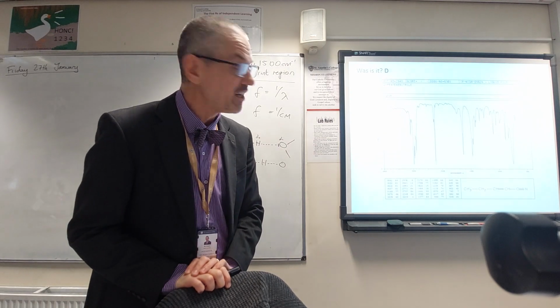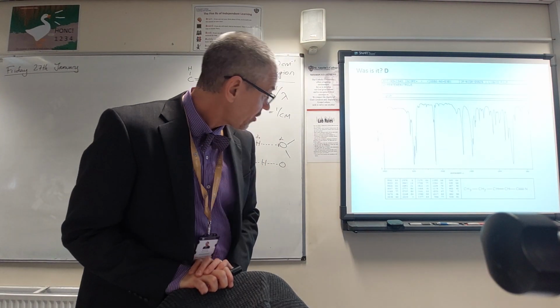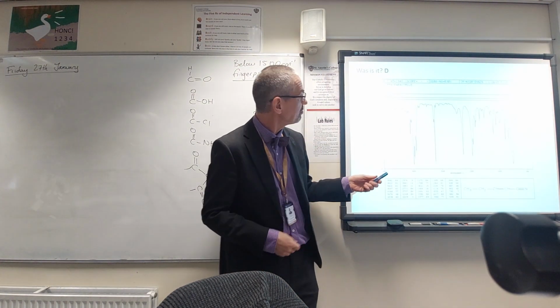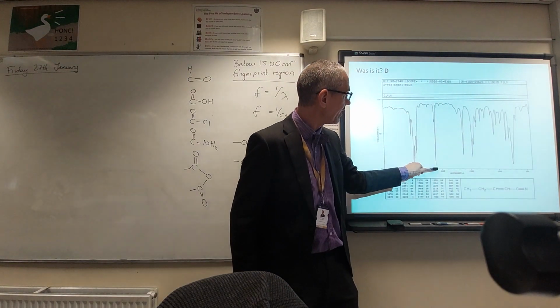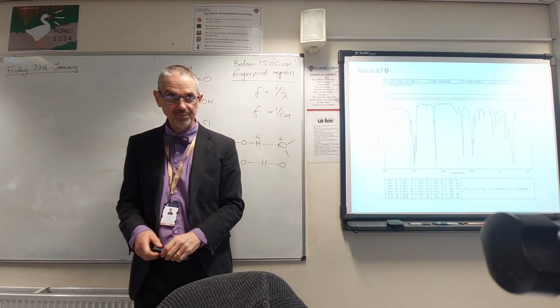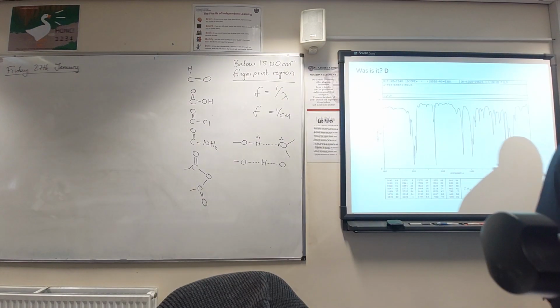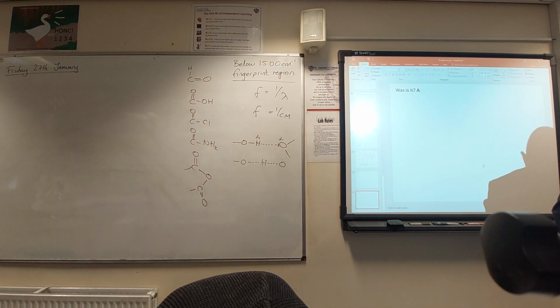Oh, it's got the answer on it, so that's helpful. Notice here. I need to do my PowerPoint again. So we've got a nitrile there. Hopefully that was very obvious, but don't miss the alkene there. Carbon-carbon double bond. So this is an alkene and a nitrile. Okay. Well done. Brilliant, Harris. Well done. Is that enough? Yeah. Okay. That was the end.